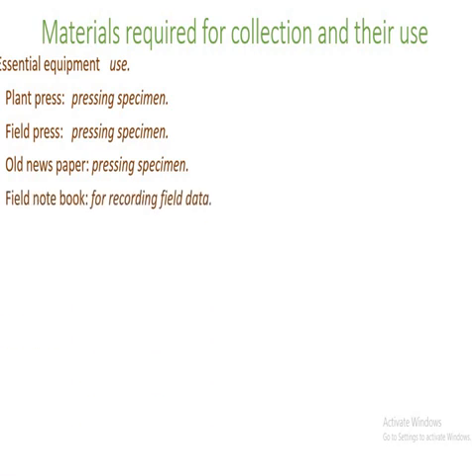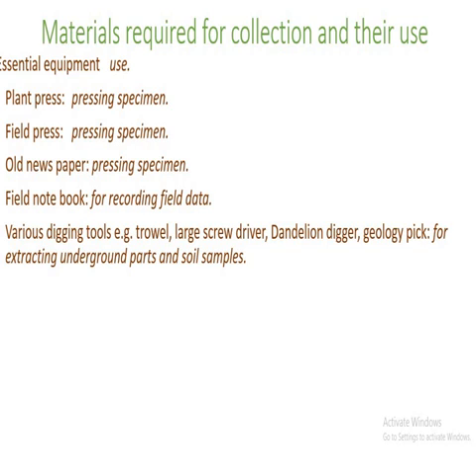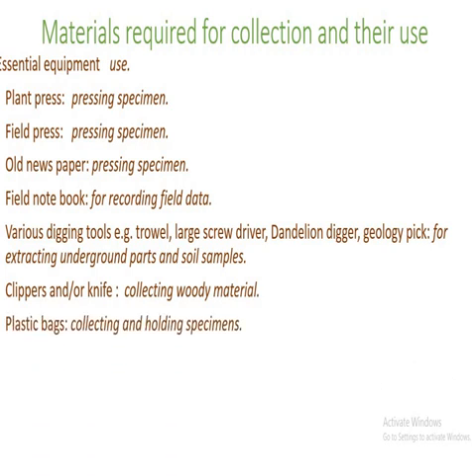You require a field notebook for recording the field information or field data. You will also require various digging tools like the trowel, a large screwdriver, a dandelion digger, a geology pick, and these are for extracting the underground parts and collecting soil, maybe soil samples. You also require a clipper or a knife for collecting woody material. You also require a calico bag. We used to have plastic bags, nowadays we use calico bags for collecting and holding the specimens.